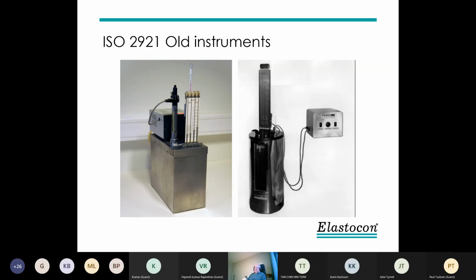One thing I always wonder, by the way, is why we have 4 test pieces here, and the standard recommends triple test pieces. I don't know why. The man who designed this died not too long ago, I think last year or this year, so I can't ask him anymore. The other one we see is a TR tester from Chias in Italy. I don't think they make it anymore. And Modulus in England had a similar one, a round one with 6 test pieces. But it's the same principle. You can lock it and you can measure on the scale.